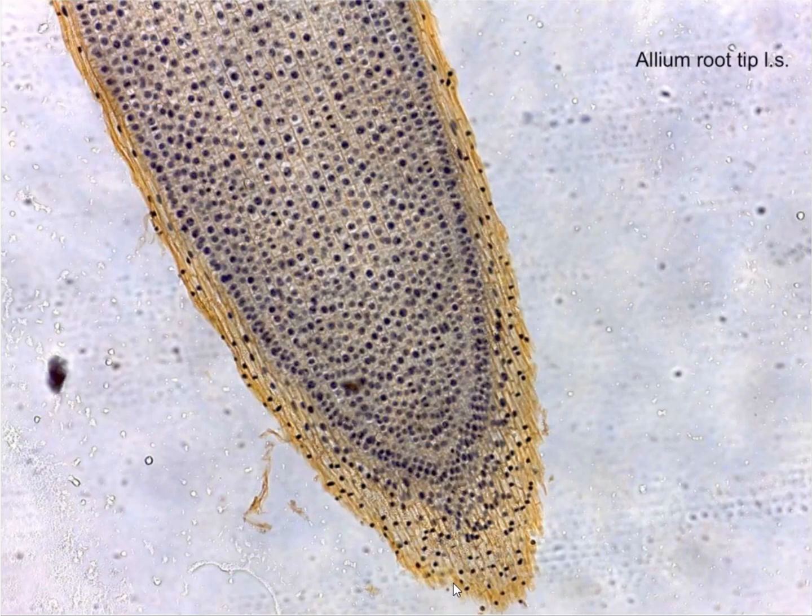So this is that same picture. We're just zoomed in a little bit more. So this is our cell elongation. This is where cell division is happening. And finally, this is our root cap.